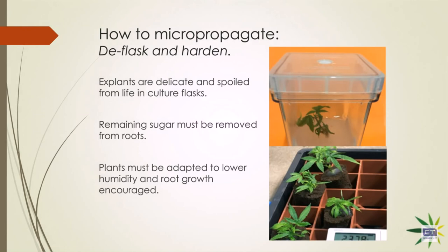Well, it sounds like at this stage in the plant, you're following basically the same protocol as a clone coming out of a clone dome, and you're absolutely trying to monitor from that same perspective. Those little plants that you see in the lower figure have just come out of the flask. They've been in a dome for perhaps 2 or 3 days, and they're tough enough now that they can handle 70% humidity. But they are only about 2 inches tall. So that's only one difference.